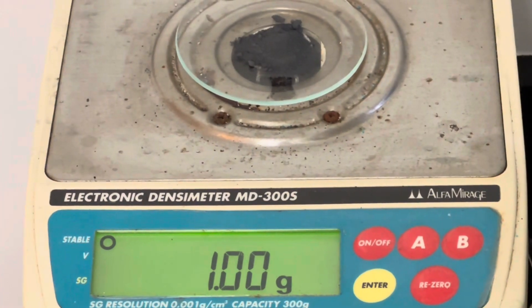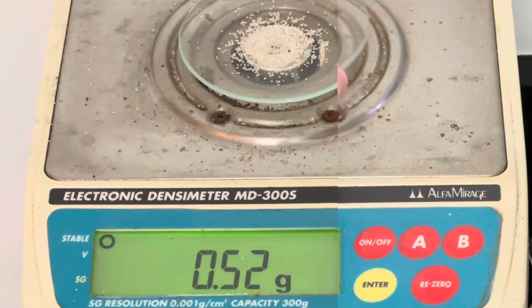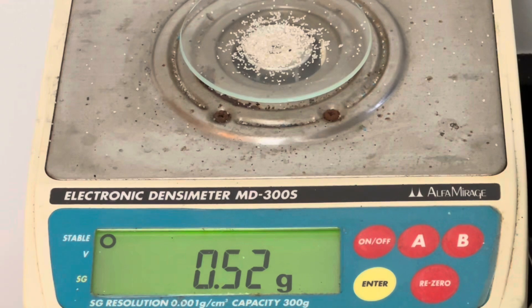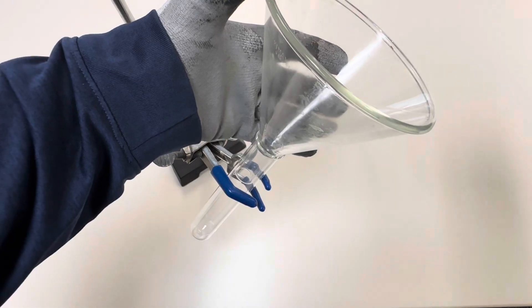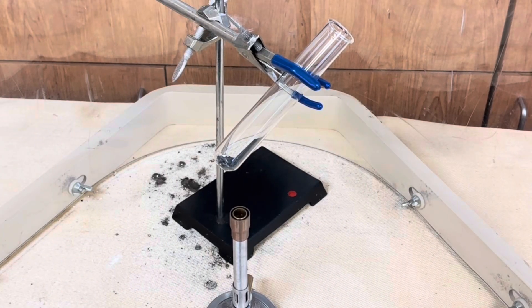The first step is to measure out one gram of powdered magnesium. Next, measure out about a half a gram of sand, or silicon dioxide. The next step is to mix the two together. Now you're ready to add your mixture to a test tube. The next step is to position your test tube so it's pointed toward a blast shield as you heat it over a Bunsen burner.